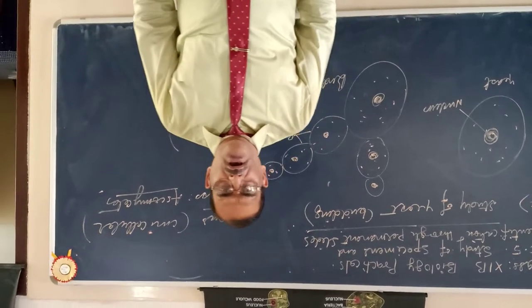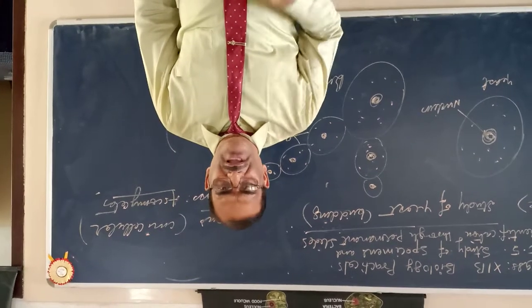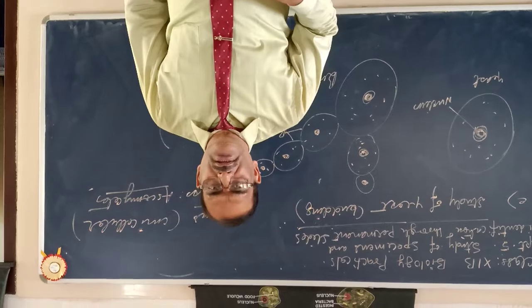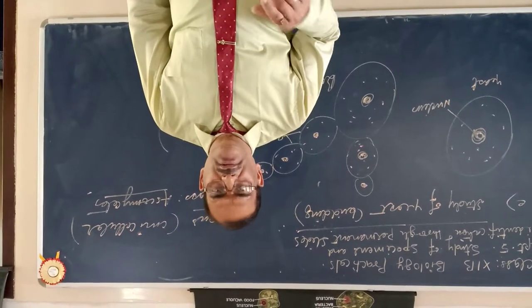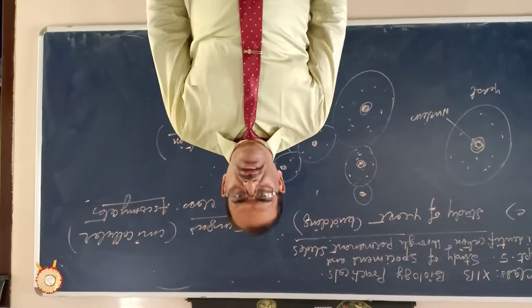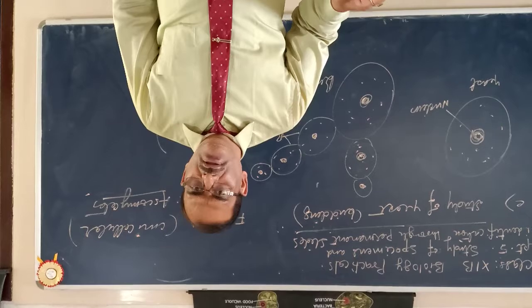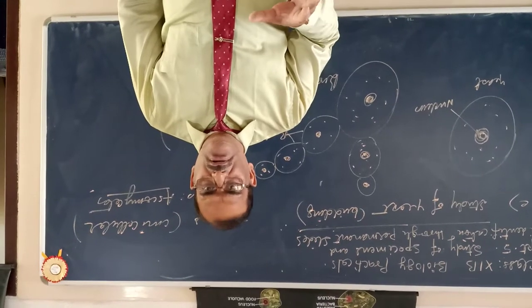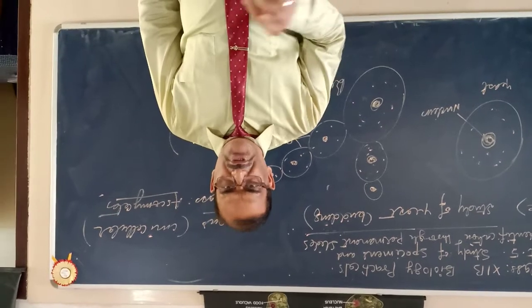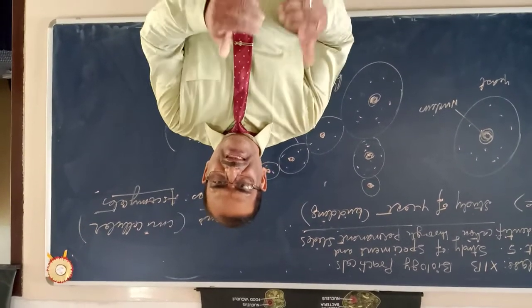Okay, for example, Nostoc. It belongs to BGA. It is a kind of BGA, filamentous, and kingdom Monera. It is a kind of BGA, cyanobacteria. So BGA belongs to Monera. Prokaryotes, Prokaryota, BGA or cyanobacteria, commonly called blue green algae. So this is the identification.